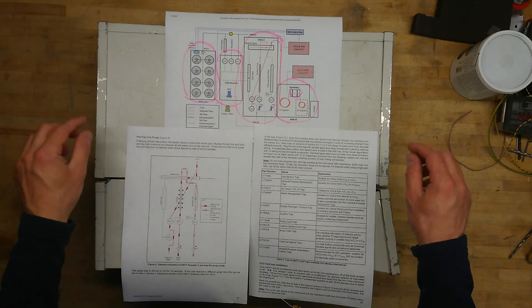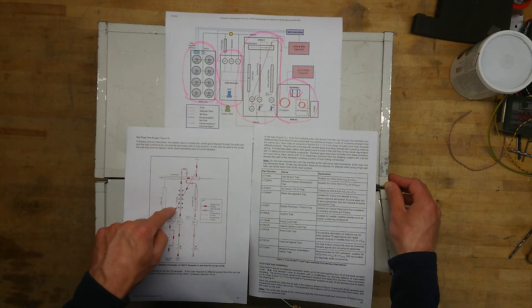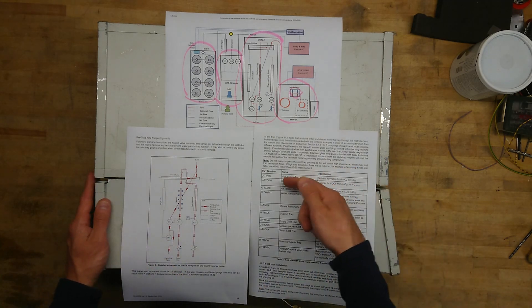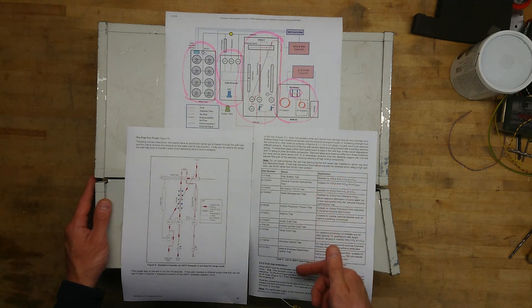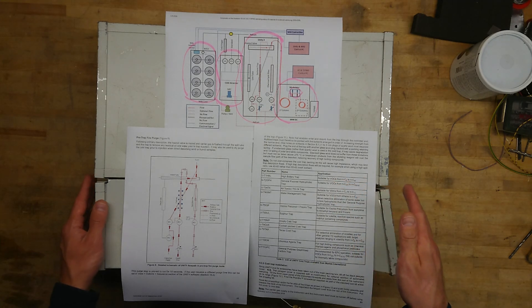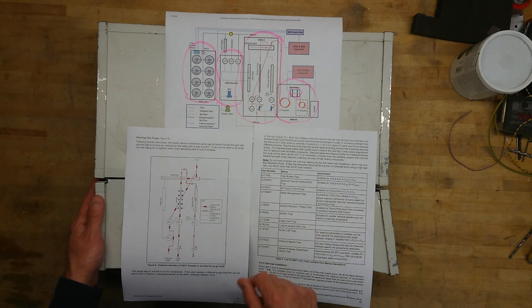So let's get this torn apart. Besides the overview of the whole test system, I have here a schematic overview of the valves, tubes, cold trap and heated valve inside this unit, along with a list of part numbers for the cold trap indicating what kind of VOC it's meant for. It has some different names: high boiler trap, air toxics, water management, ozone, sulfur, custom-packed cold trap, chemical agents. So this can actually let us guess what this unit was used to measure from the part number of the cold trap itself.